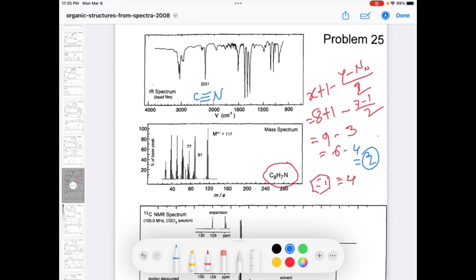And that always has a band or peak around 2200 to 2300. So here we see there is a band at 2251. That is proving that we have a nitrile group, C triple bond N. For a triple bond, the degree of unsaturation is 2, because it's equivalent to two double bonds.